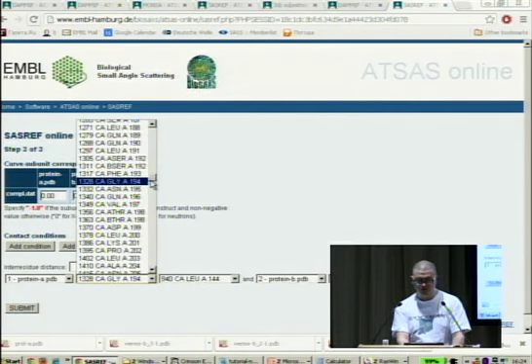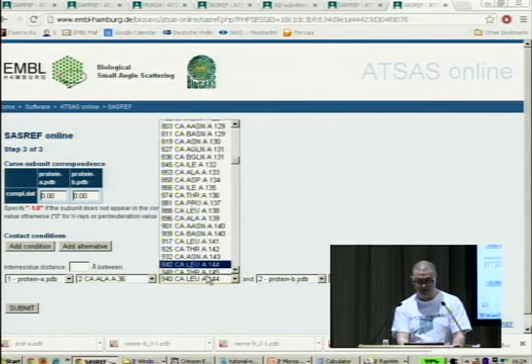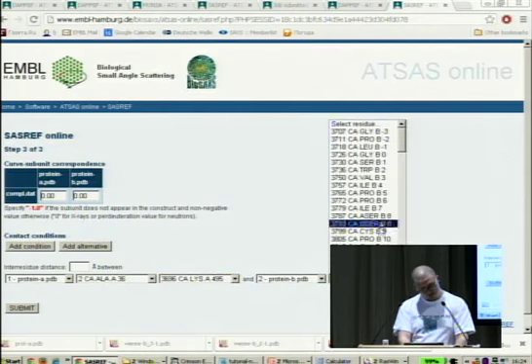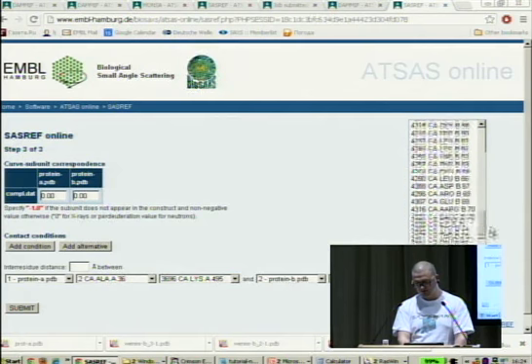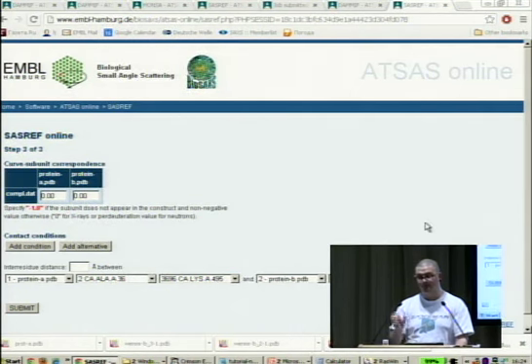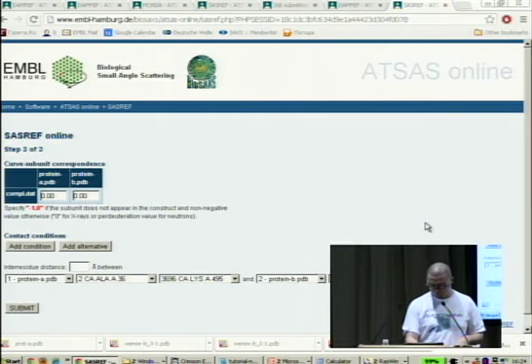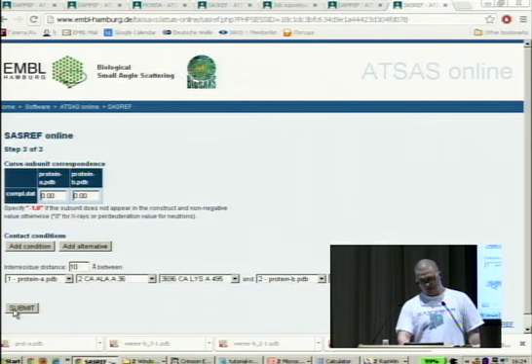However, we do not have this information, we can restrict it saying that these two subunits should contact. So if we do not put this restriction, most probably it will work. But here I just select first to last residues, saying that they should contact somewhere. So typically, if you do not put this restriction, the program will still come up with a model, but the model might be disconnected if that would yield a better fit. So, and you say that the distance should be, I don't know, 5 angstrom, 10 angstrom, and you click submit.